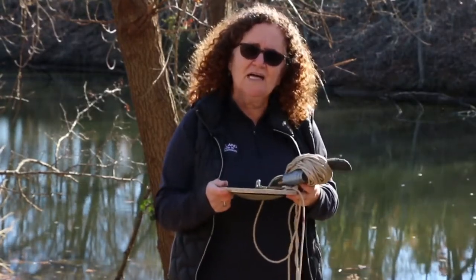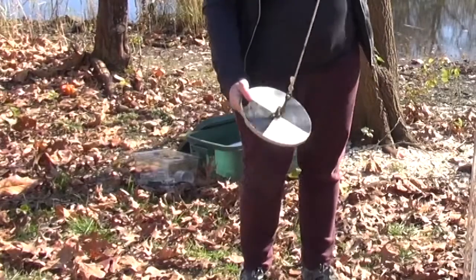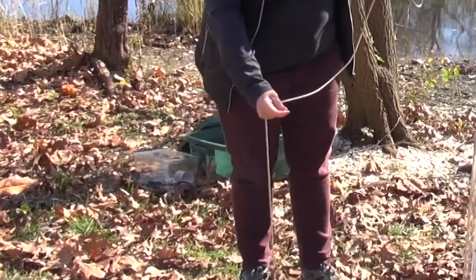If we were in a deeper body of water we would use this from either a dock or a boat, and we would go on the shady side and we would lower it into the water until the black and white marks disappeared.